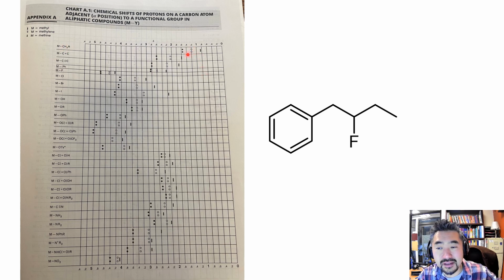So you expect to see something like 1.2 according to that, but because at a distance there's an electron withdrawing group, it's probably going to be something like 1.4 in real life, but this still gives us a fairly precise ballpark.